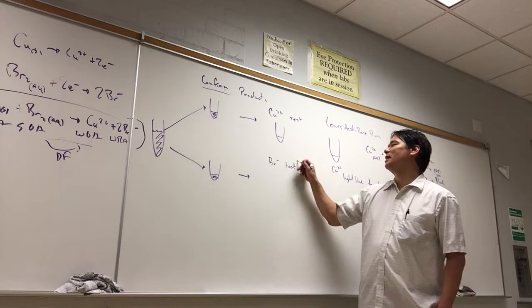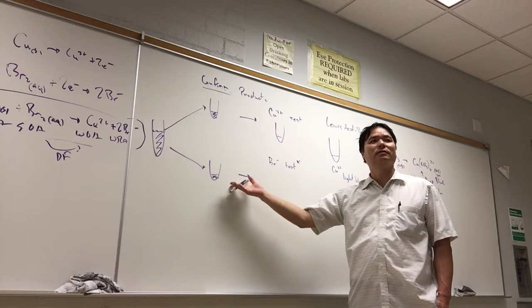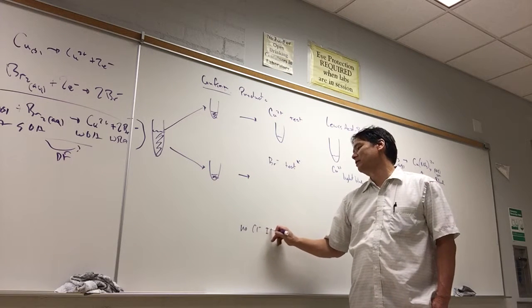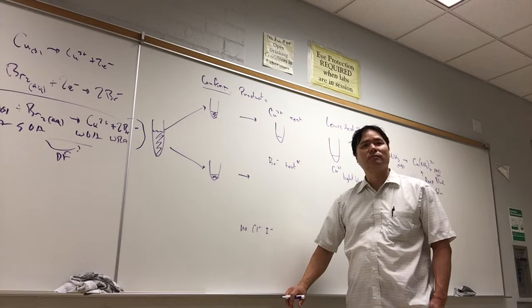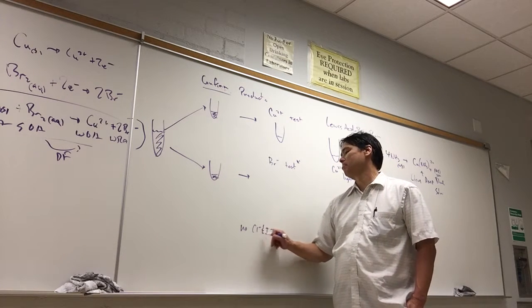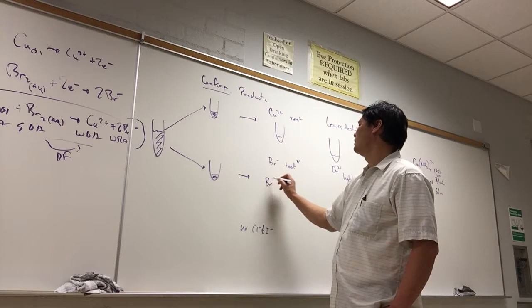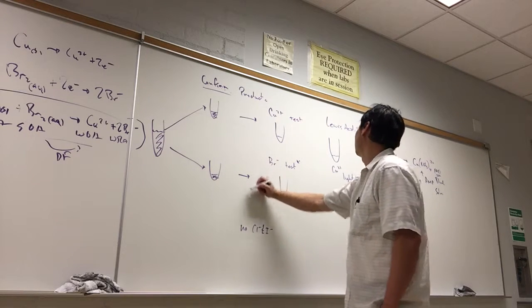And so this bromide test, we know that there should be no chloride or iodide, right? And so we'll just say that, no chloride, iodide present, because we know what we mix together in the test tube. Well, anyway, if we have bromide present in the test tube, then all we do is this.